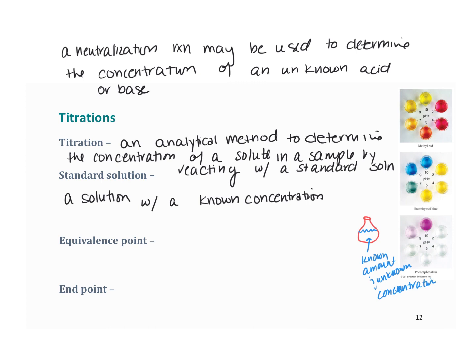Then you're going to have a burette here, or a dropper or something along those lines. It's going to have a little dial, called a stopcock, and different volumes marked on it. You are going to have some liquid inside of this, and this liquid will have a known concentration. That's your standard solution, so it's going to be in the burette.